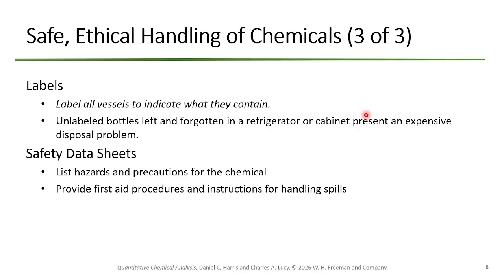What do you need for your label? What are the components of a good label? When it's made. Very good. The name of what? Yeah, the compound solution. If it's a solution, make sure that you indicate it's like this percentage or this molarity or what it's in if you made it not using water.